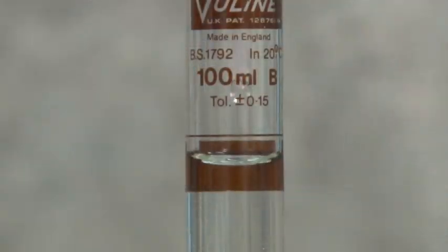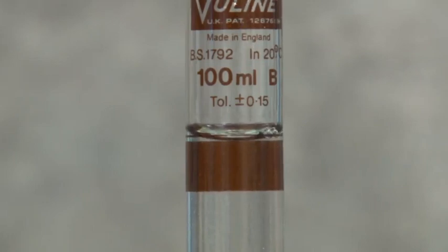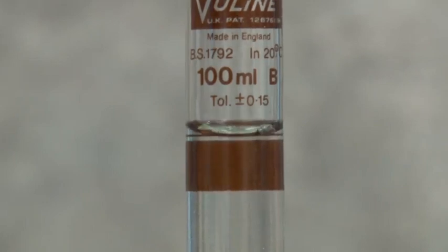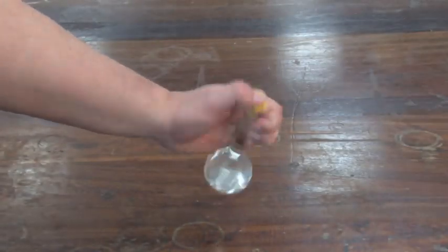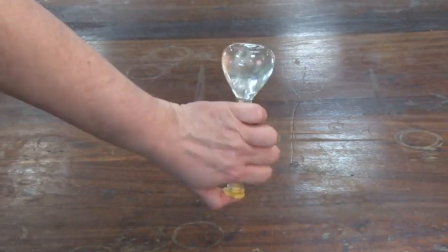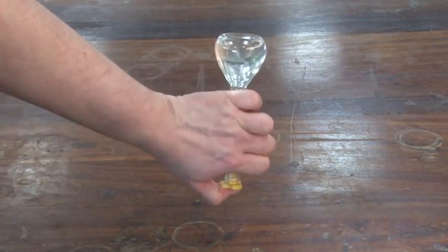Make the solution accurately up to the mark, adding distilled water via dropping pipette until the base of the meniscus is perfectly aligned with the mark. Stopper the volumetric flask and then mix the contents thoroughly by repeated inversion.